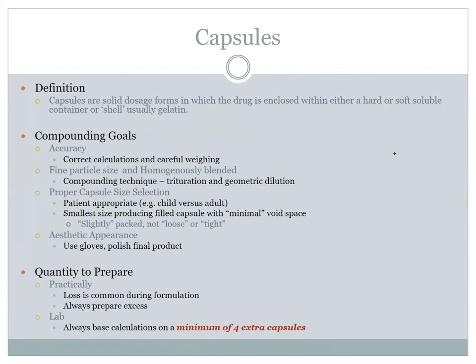Last week we were making a topical powder, something to use externally. Now what we want to do is take powders and consume them internally in an effective way for dosing, for swallowing and for consuming those powders. And capsules really do work best. So a quick definition: capsules are solid dosage forms in which the drug, usually in the form of a powder, but not always, is encapsulated or essentially enclosed in either a hard or soft gelatin capsule.